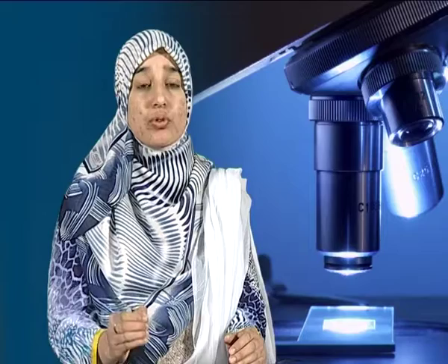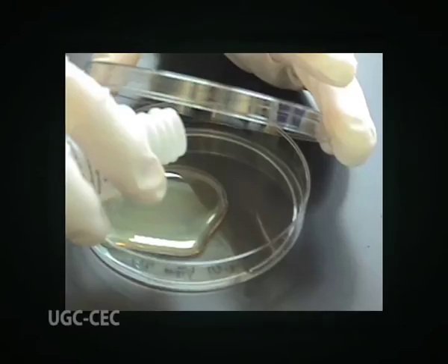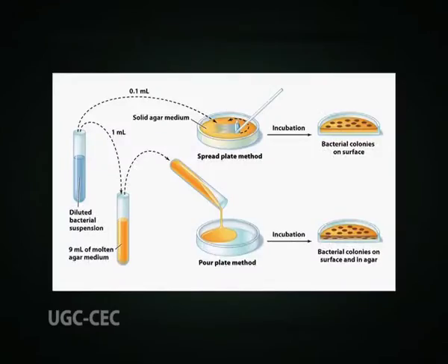However, SPC procedures for selected groups are further limited by the degree of inhibition and effectiveness of the selective and differential agents employed. Although the SPC is more often determined by pour plating, essentially comparable results can be obtained by surface plating.